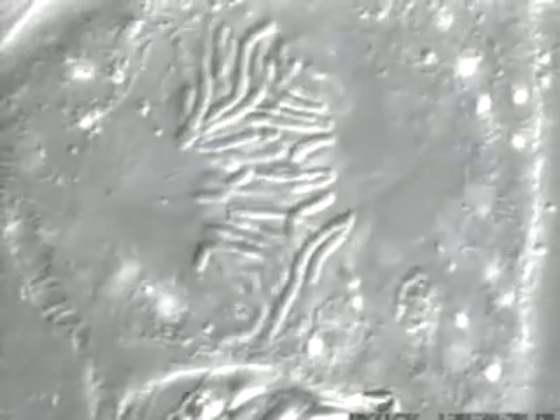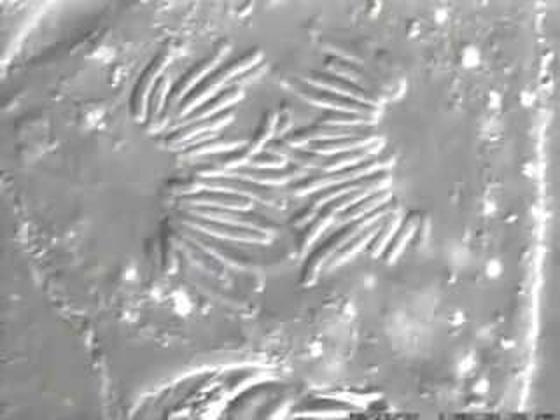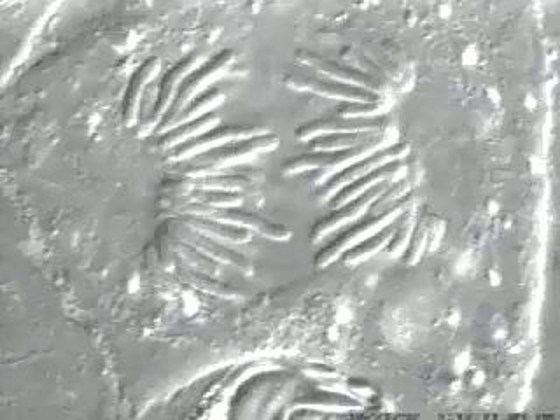When the centromeres divide, the daughter chromosomes can be pulled to the poles of the spindle during anaphase. This movie stops short of telophase.